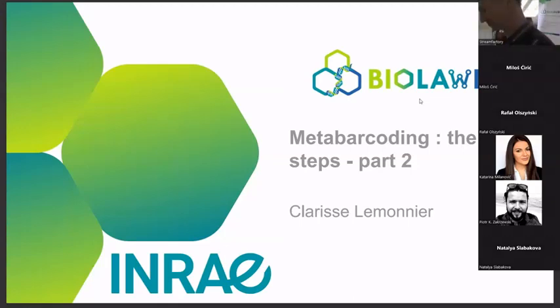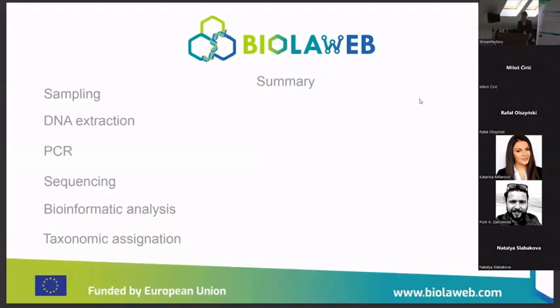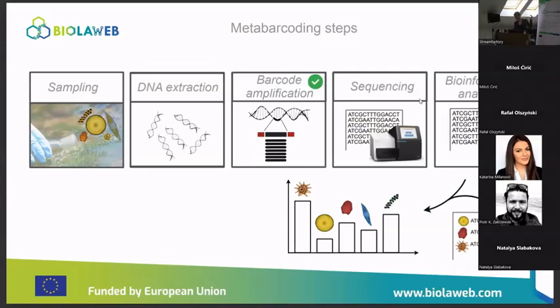So here we are after lunch for the second part of the metabarcoding workflow. We will go through all of it and see particularly the lab work and the sequencing technology in detail, and the bioinformatic pipeline. So I will go through all these steps. Don't hesitate if you have any questions. I will take a moment at the end of each step before going to the next ones.